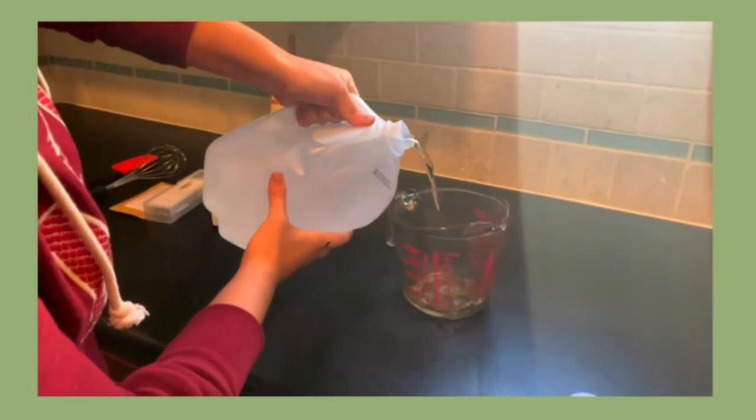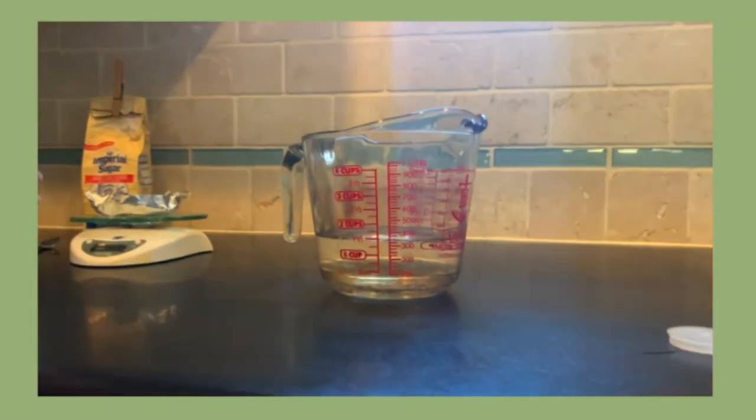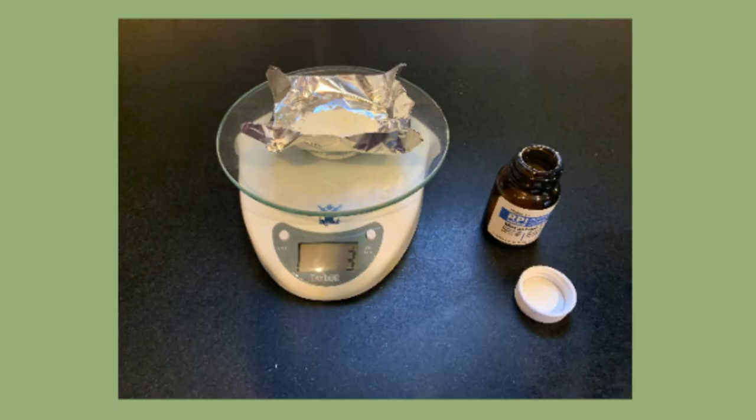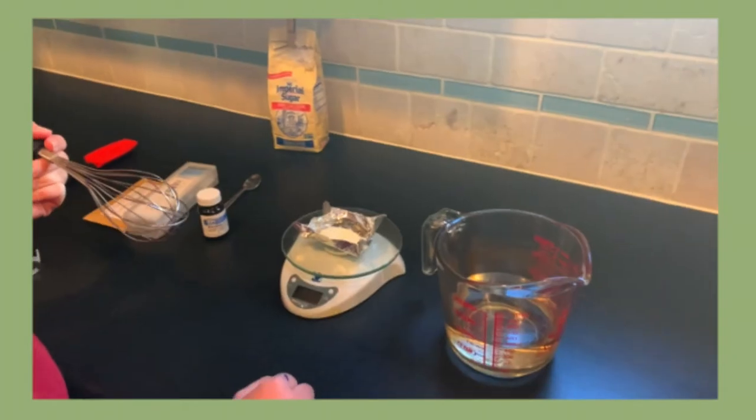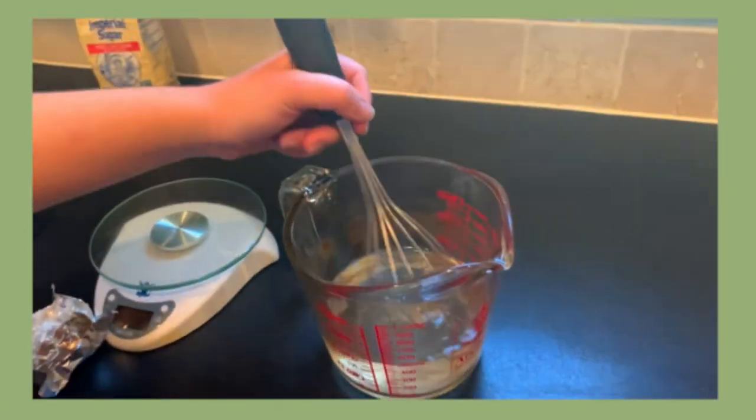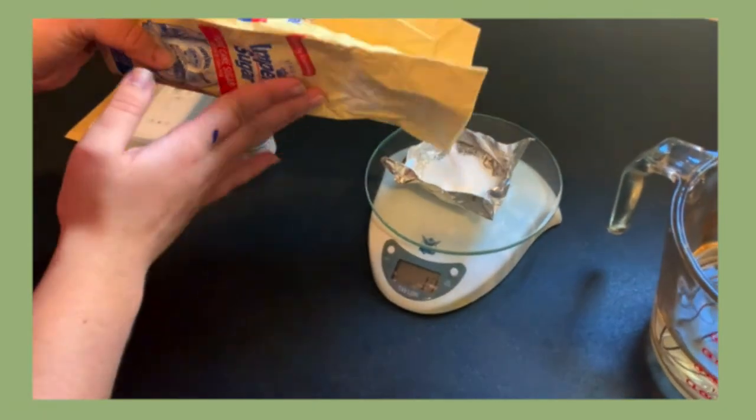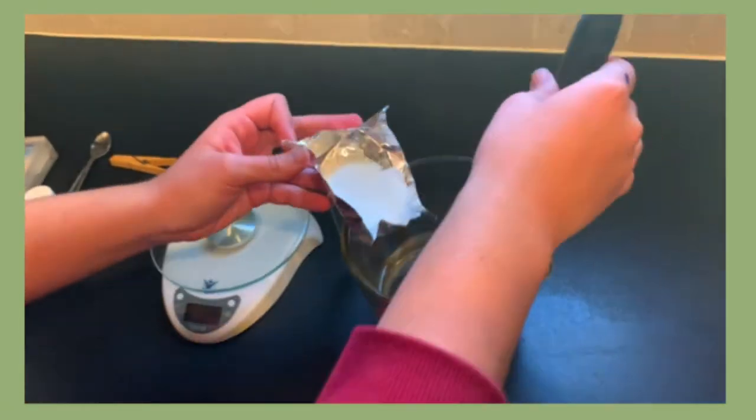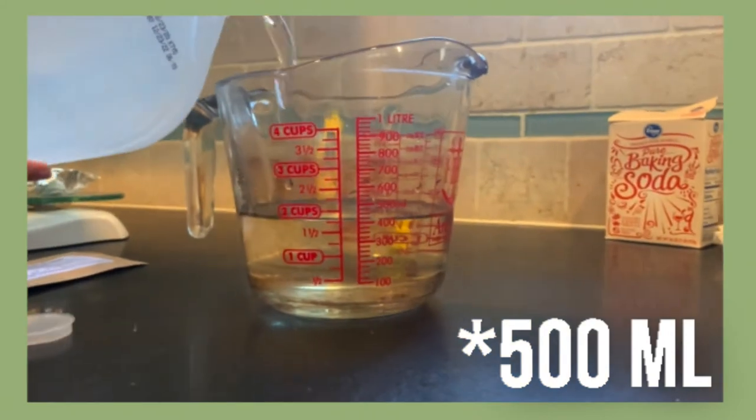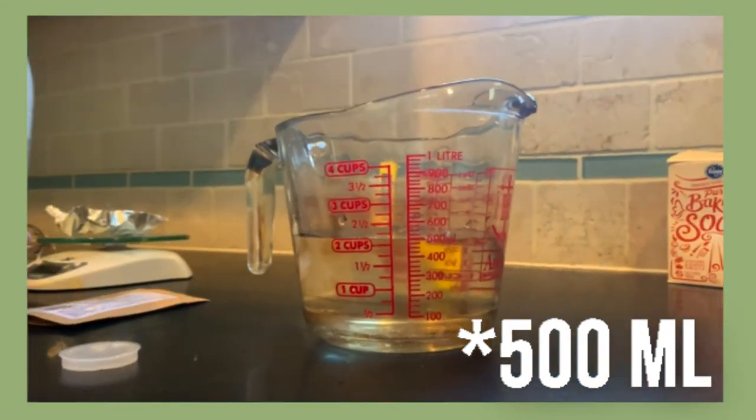You should make the medium in the 1 liter container. Pour 400 milliliters of distilled water into the container. Measure 3 grams of the MS medium using an aluminum foil weigh boat and the kitchen scale. Pour the powdered medium into the water and whisk until fully incorporated. Measure 15 grams of sugar. Whisk the sugar into the mixture until fully incorporated. Add distilled water to the mixture until 500 milliliters is reached.